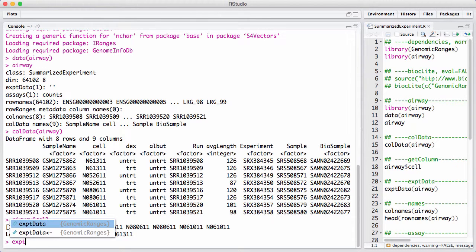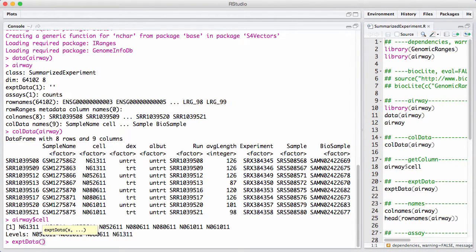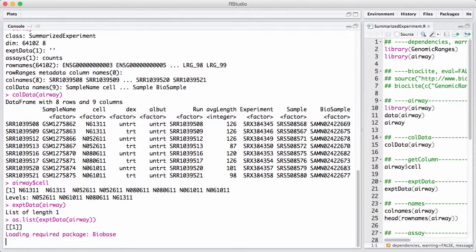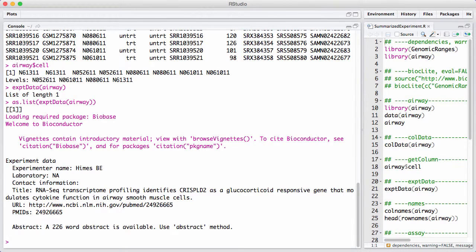We can look at experiment data — details about how the experiment was made. In this case it's pretty empty, but there is some information. We can see which paper the data comes from, and we can see a PubMed ID and so on.